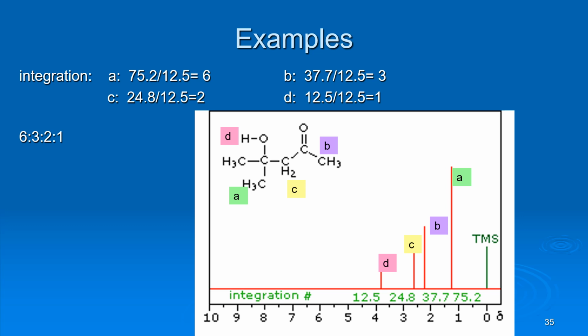So we can see here that we have 1 hydrogen attached to an O. In this case, these are equivalent. So these 6 hydrogen are both attached to a carbon. So they're going to likely be the least deshielded, or the most shielded. This one's pretty shielded too, because it's a sp2 hybrid, and that's 2 there.